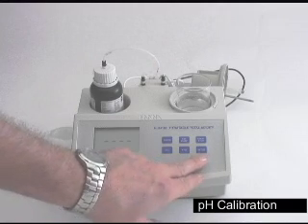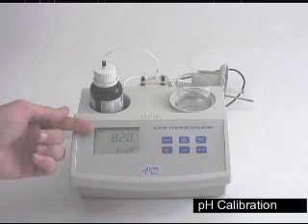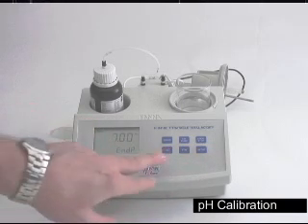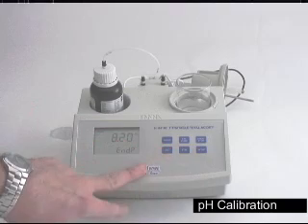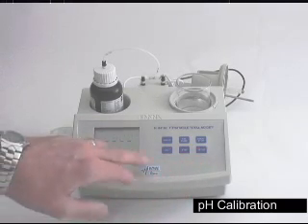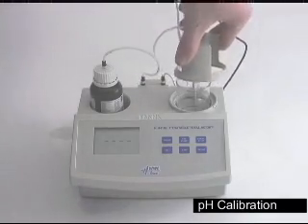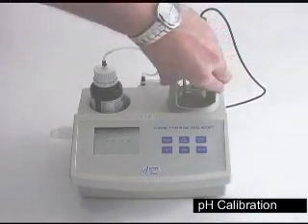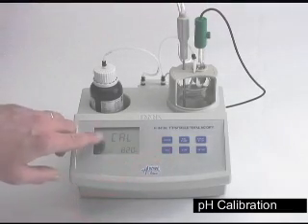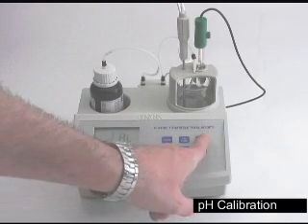The far bottom right button is the setup button. When you hit this button, it will let you choose between endpoint 8.2 and 7. In this case, we're going to be calibrating and testing at 8.2. Hitting the setup button again will remove it. Place the probe and cap back in the container, turning half a turn to lock it in, and hit the cal button.